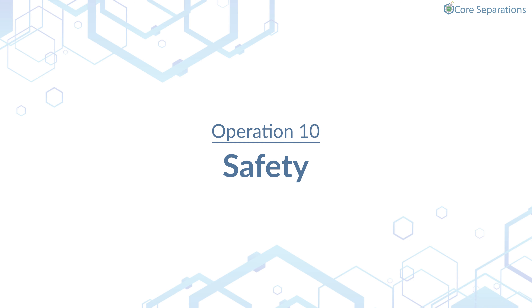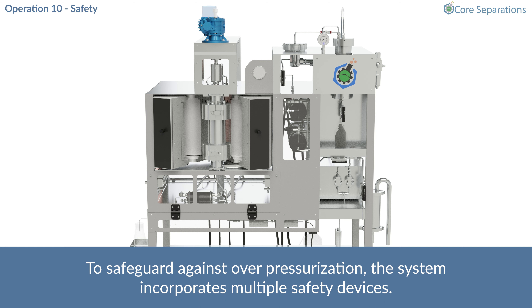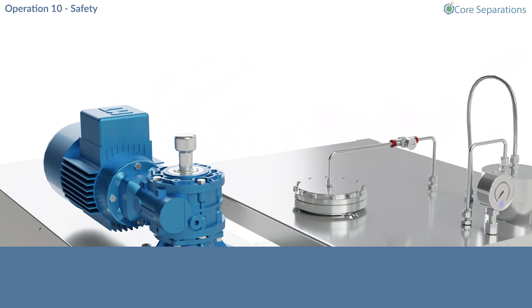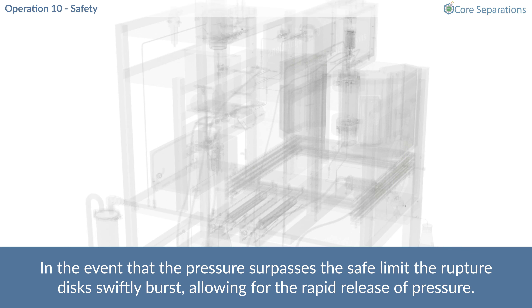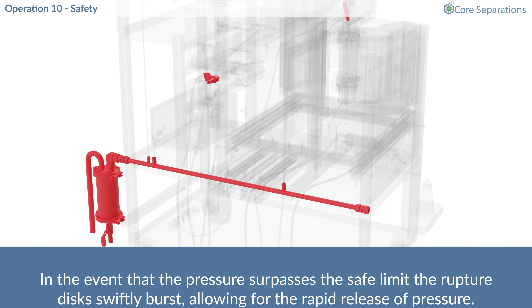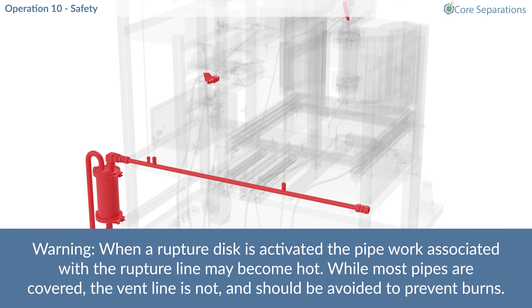Operation 10 – Safety. To safeguard against overpressurisation, the system incorporates multiple safety devices. In the event that the pressure surpasses the safe limit, the rupture discs swiftly burst, allowing for the rapid release of pressure. Water discharge travels to the catchpot, located to the right of the system. Warning – when a rupture disc is activated, the pipework associated with the rupture line may become hot. While most pipes are covered, the vent line is not, and should be avoided to prevent burns.